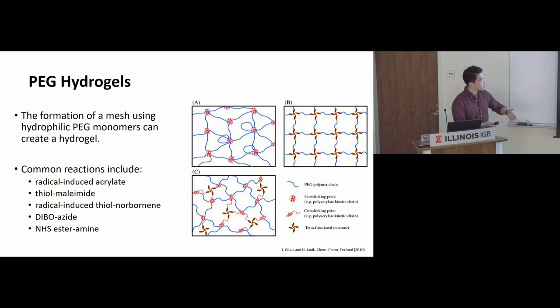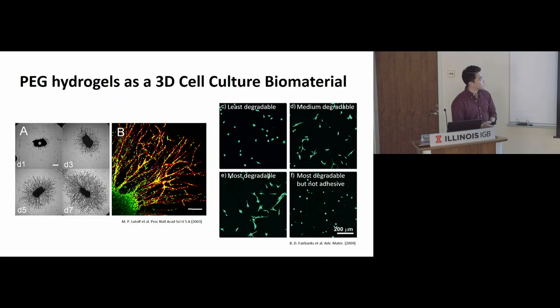So yeah, I was just trying to show you how hydrogels are made. And PEG hydrogels have already been used since 20 years ago to culture cells in 3D.